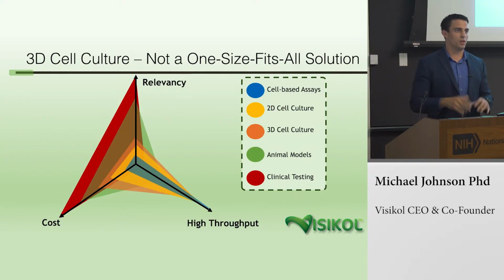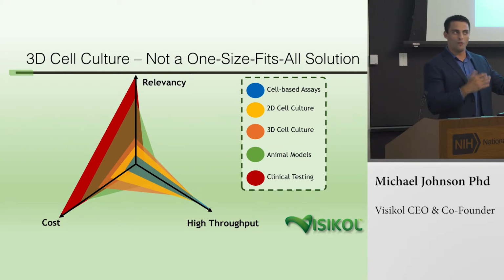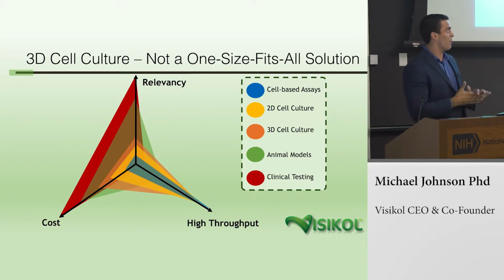Now, this is another really important slide, and this drives the point home that there are advantages and disadvantages, and 3D cell culture models are not a replacement for 2D cell culture models. I think there's a lot of companies that are trying to sell 3D cell culture models on a plate and say, get rid of all the 2D stuff you've done before, moving to 3D, but I think that is sort of an improper justification, because 2D is a balance with 3D as far as cost and throughput.